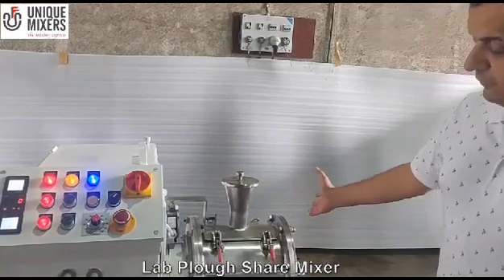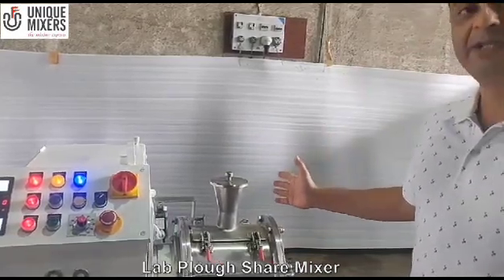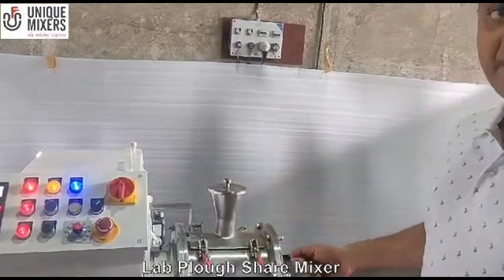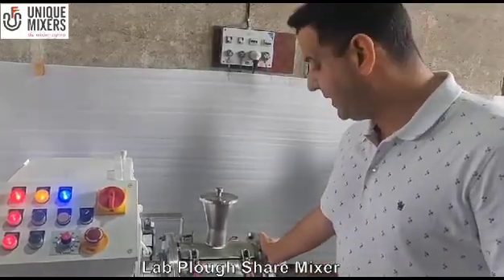It features a cantilever design, easy for cleaning. This mixer is suitable for handling solids as well as slurries. The advantage of using a ploughshare mixer is quick blend times. The mixing vessel is stainless steel 316L.